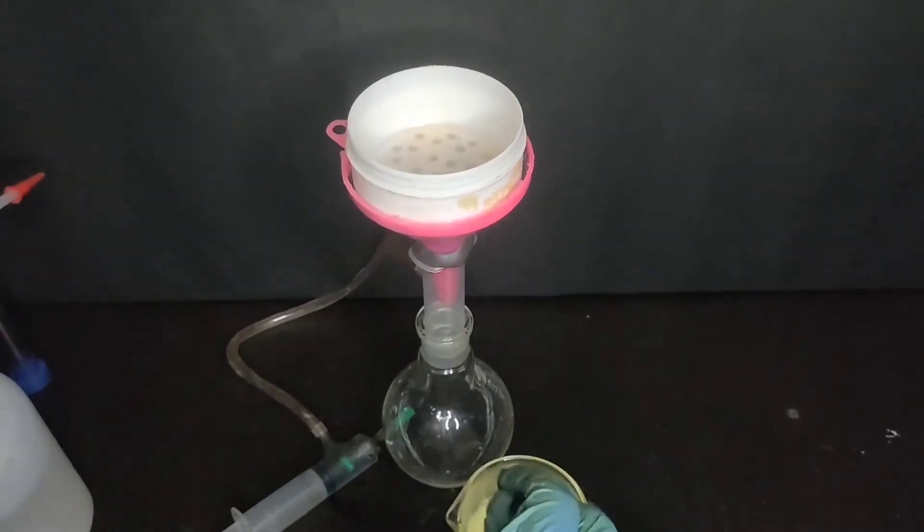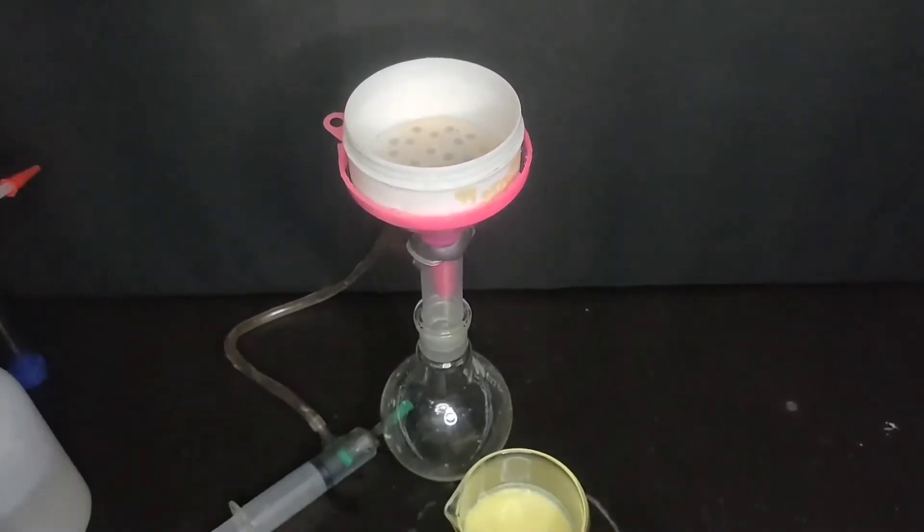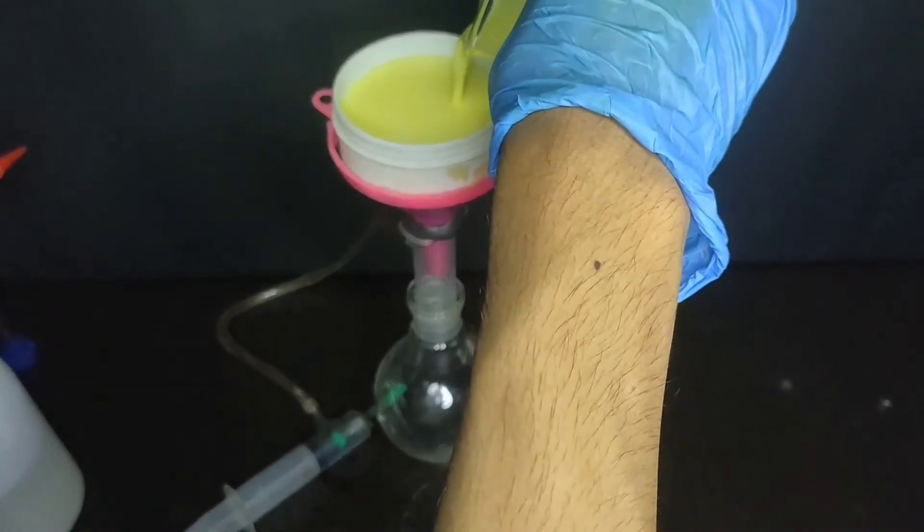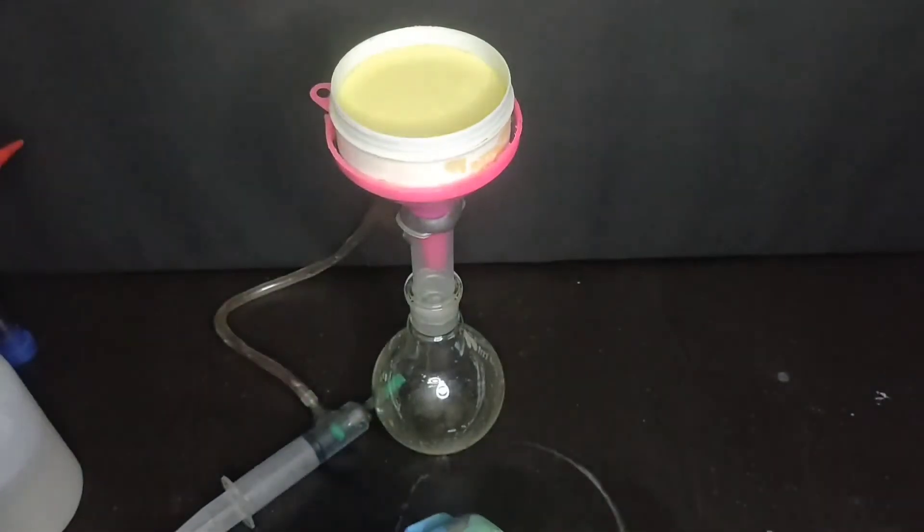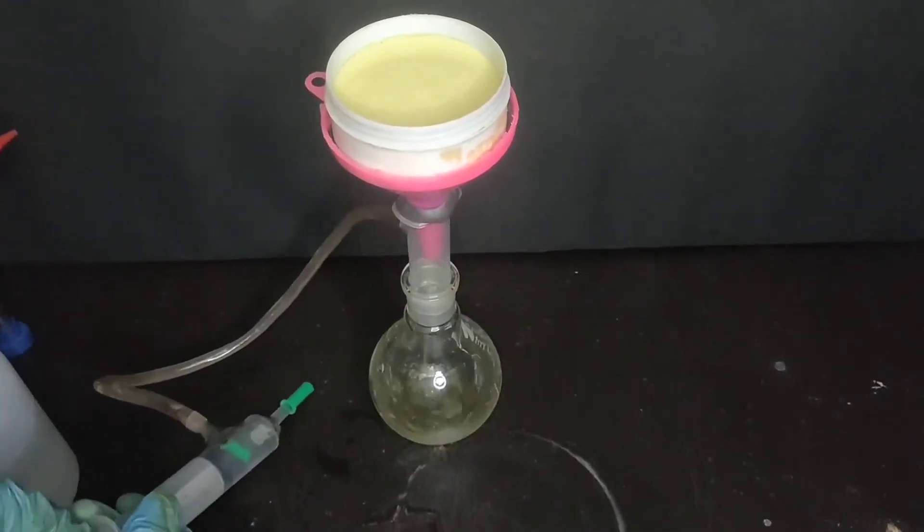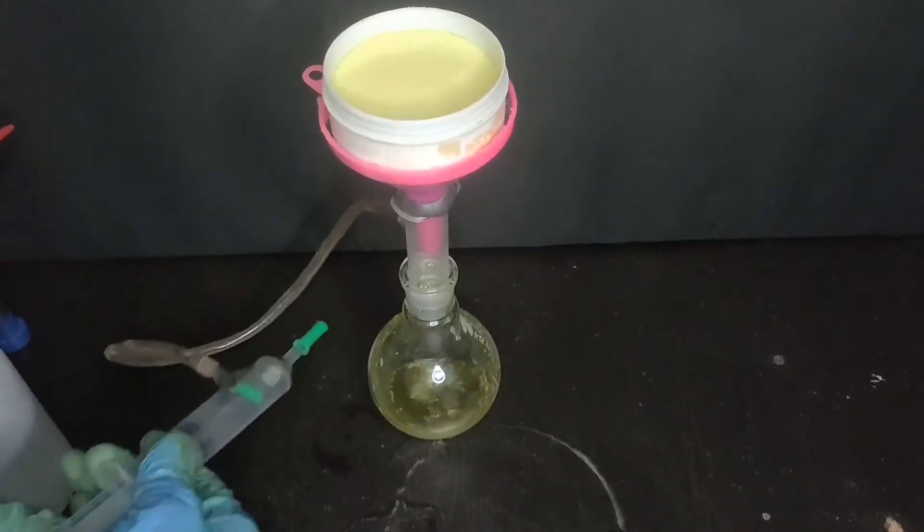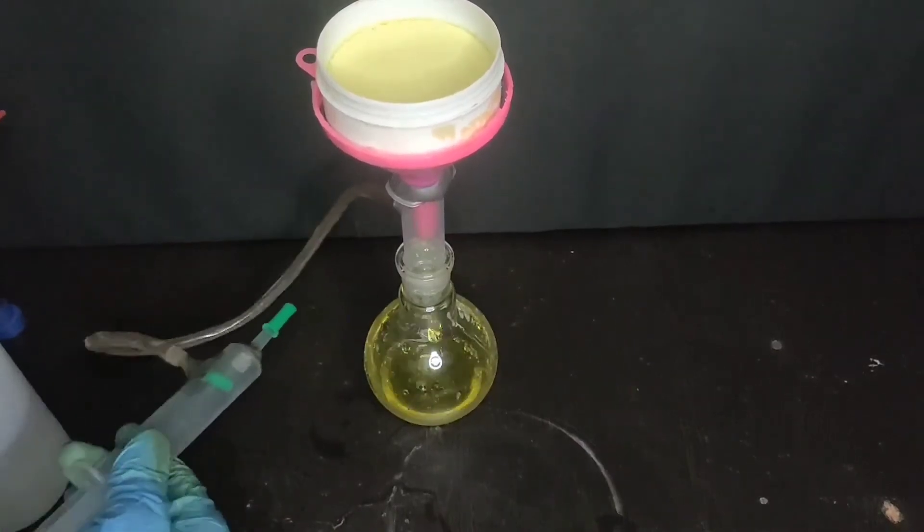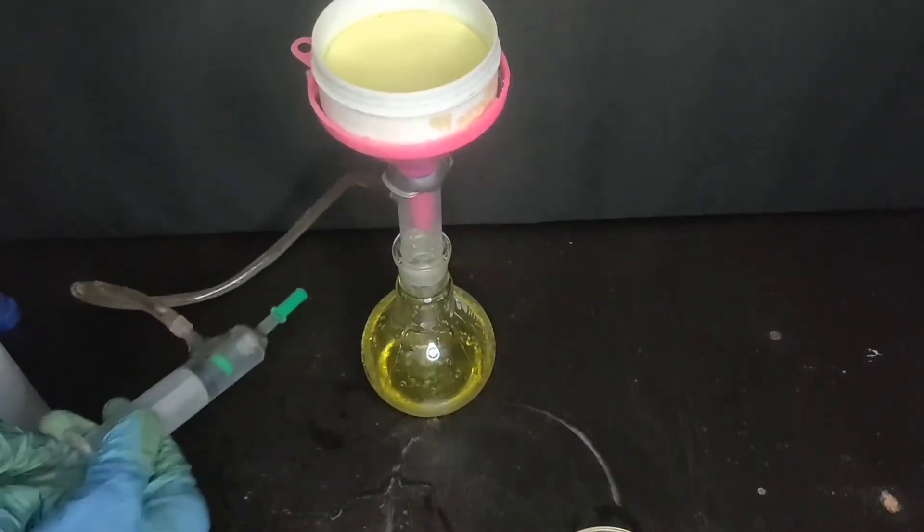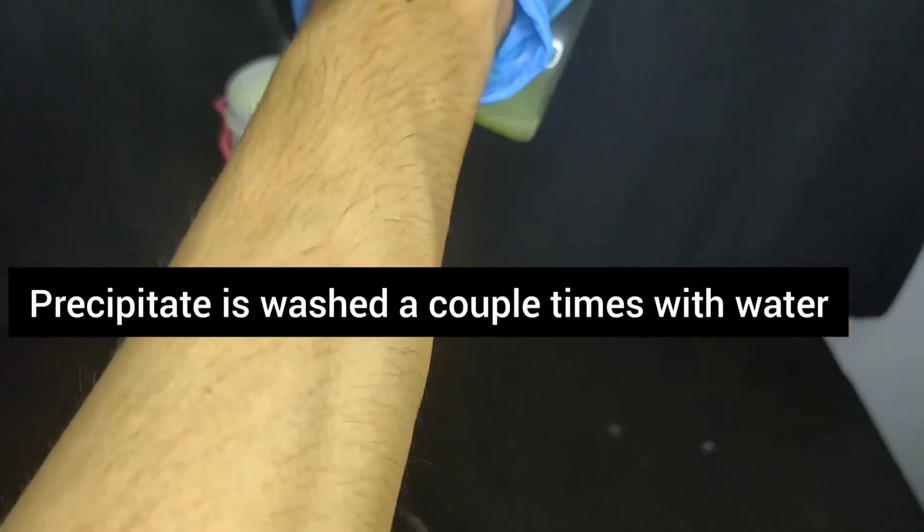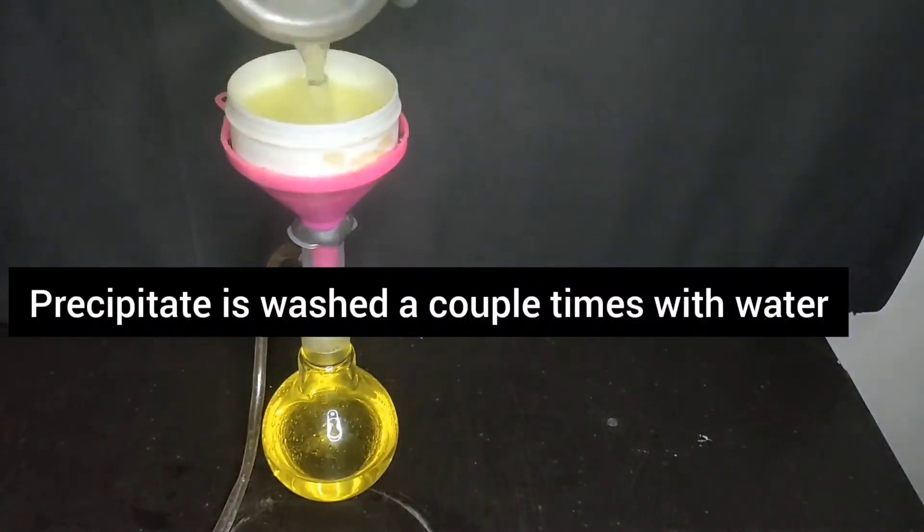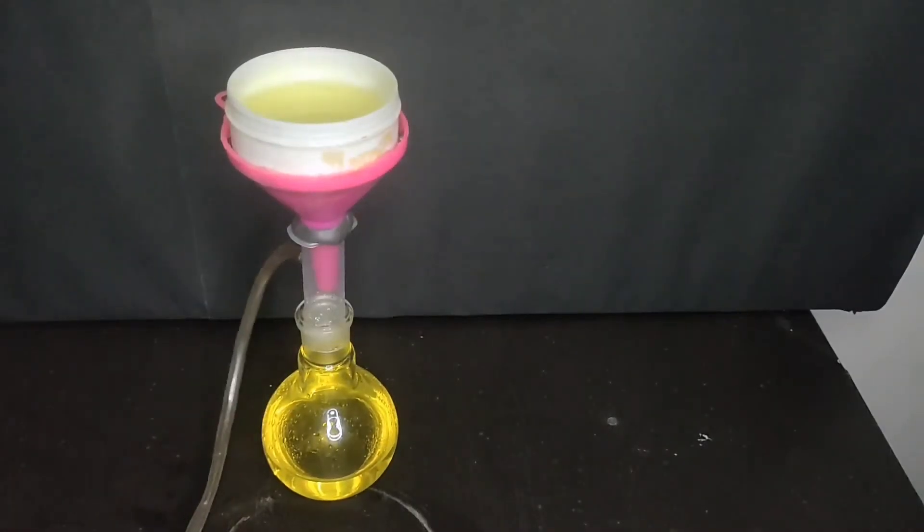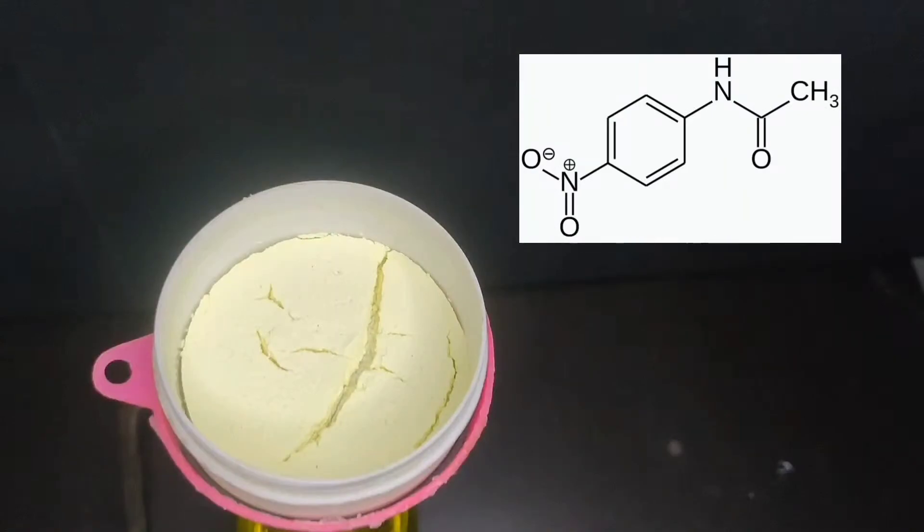The precipitate is then filtered using vacuum filtration through my DIY Buchner funnel. The precipitate is washed a couple of times with distilled water. This is the para-nitro acetanilide.